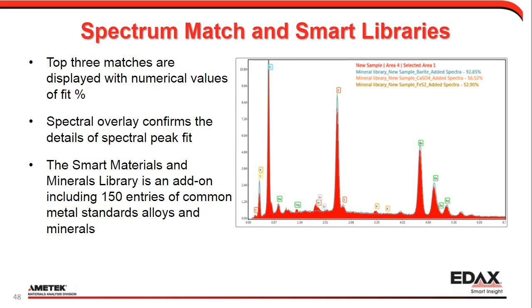The top three matches are displayed with numerical values of fit percentage. Spectral overlay confirms the details of spectral peak fit.